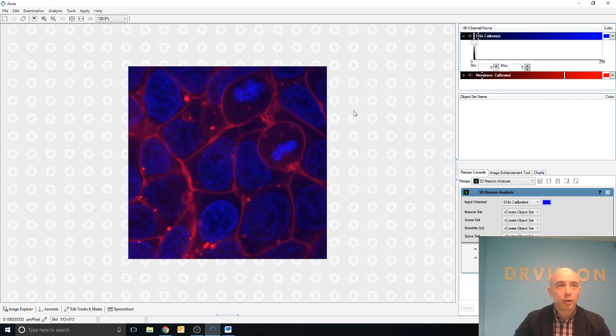Now you may be wondering, why are these channels so different from each other? Different levels are necessary because the data collected has different properties. Different properties such as different physical structures, like you can see here, or different fluorophores used in imaging. There are numerous reasons why you might want to visualize multiple channels. Common reasons are to see different physical structures at the same time, such as in this dataset, or perhaps to visualize the co-localization of different fluorescent labels.